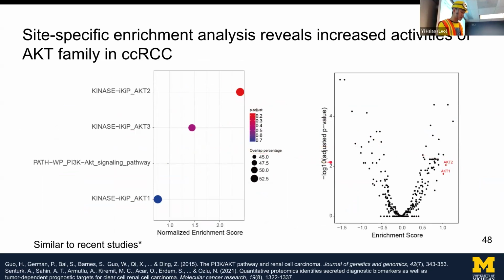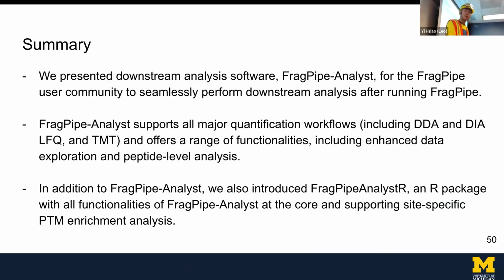show up consistently across the two different software. They have a different enrichment procedure, but overall we find this AKT2 is of interest. And when we go back to the literature, it's really interesting. This AKT2 is also reported in another renal cell carcinoma study. So we think it's of interest, and we might have another project to look into it in more detail.